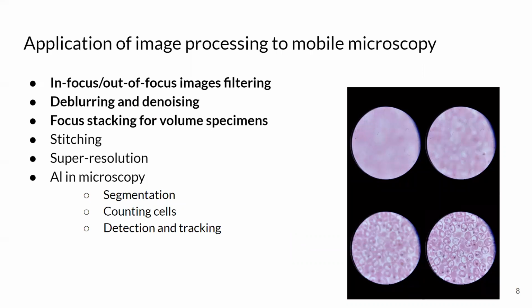Some works also demonstrated real-life applications of that technology. But the problems and tasks remained the same as in common microscopy, and even became more difficult because of cheaper optics and a lot of visual artifacts. In our work, we are focused on different techniques that might significantly increase the quality of the data obtained from the mobile microscope.